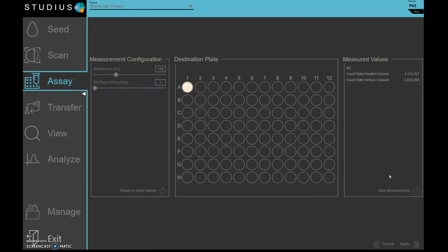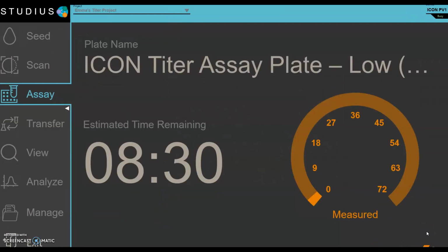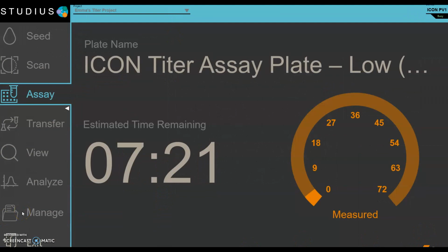For low-range titer plates, this is very easy to achieve. However, with high-range plates, you may struggle to get both ends of your standard curve to fall within this range. Try to be as close to the range of 4 to 6 million. However, expect to have outputs of 3 to 7 million. Once your instrument is calibrated, set your plate to run and wait for the results.